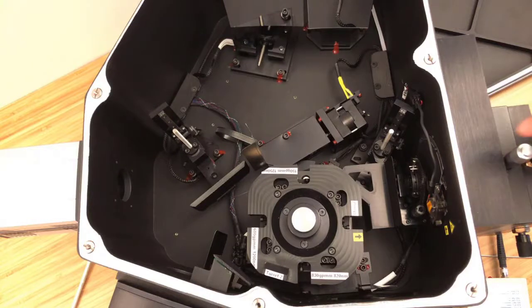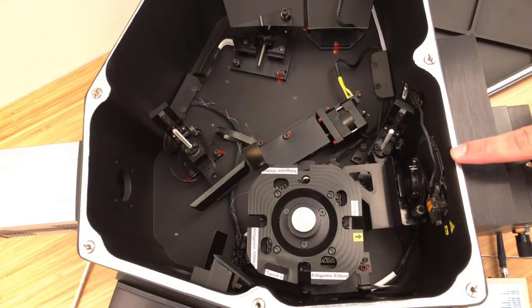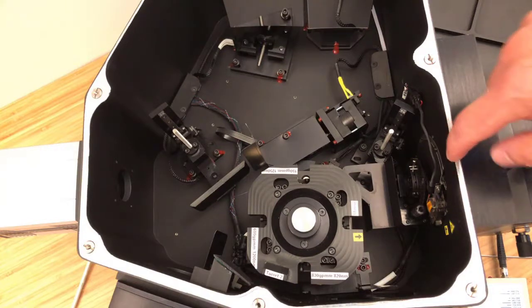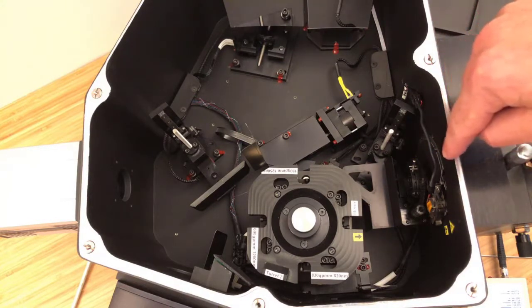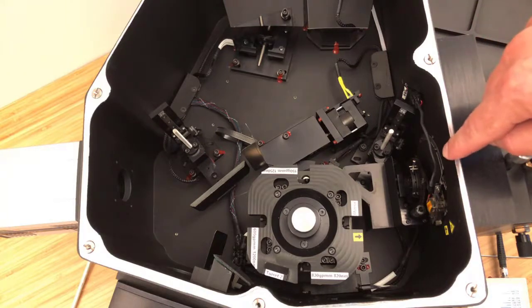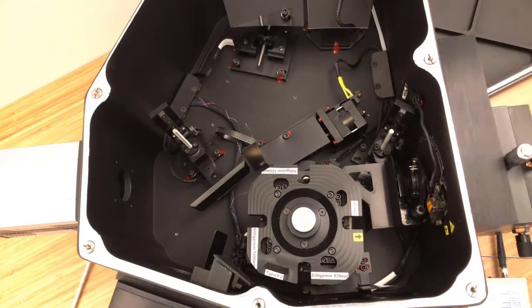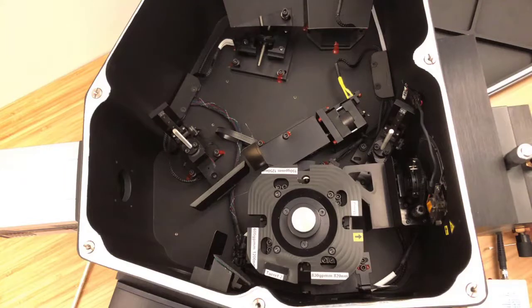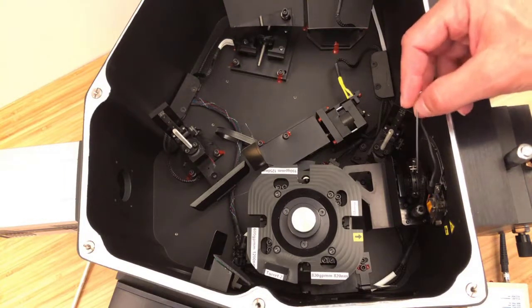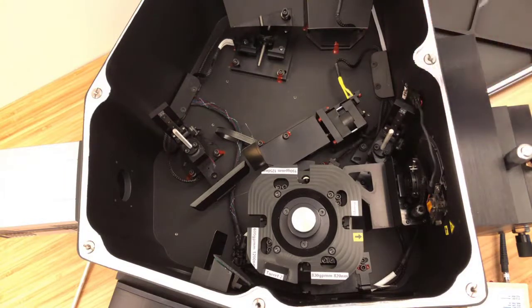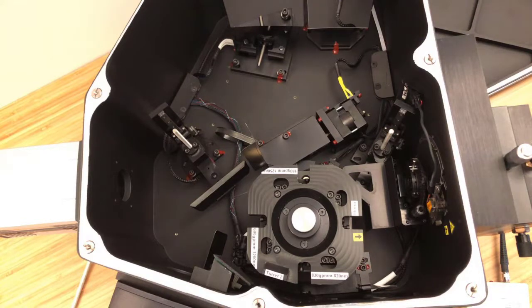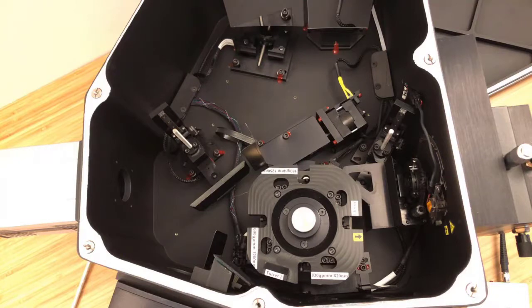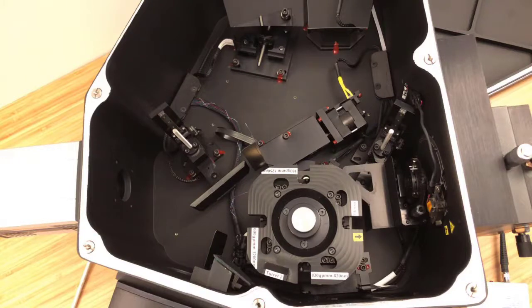So starting with the fiber over here, where the light is coming from, the light comes from the fiber, from the side input here. It passes through a shutter on the inside, which is useful for controlling CCD exposure. And then a motorized and computer controllable TrueRes iris, which is right here. The TrueRes iris allows us to control the F number of the spectrometer and increase the spectral resolution by up to 50% when needed. Normally, I'll have it entirely open, but when required, I can activate it through the software.